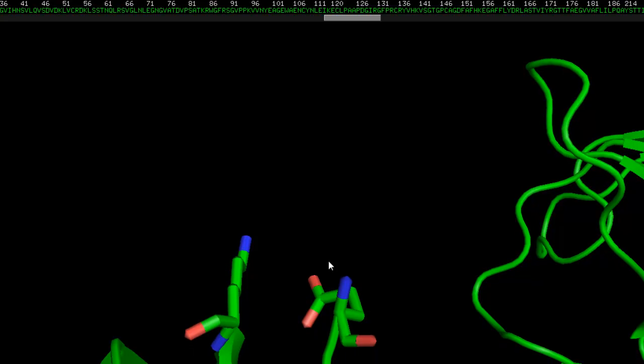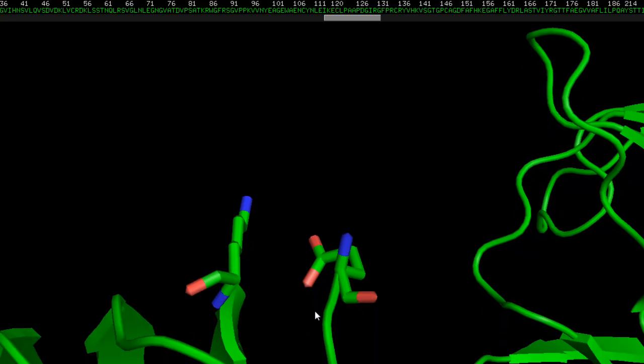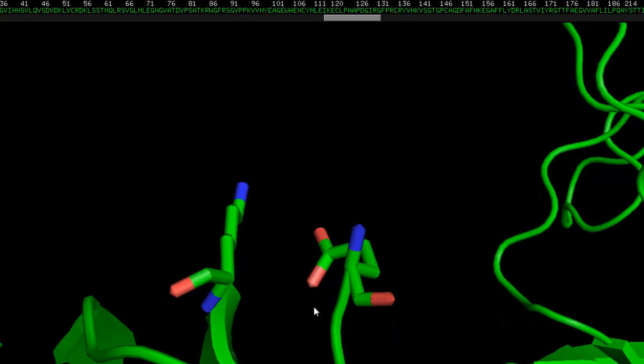That's pretty much it. That's how you delete an amino acid, or in this case, several amino acids from PyMOL. Now the issue here is that we have a gap, and we need to close this gap. This doesn't look very good.